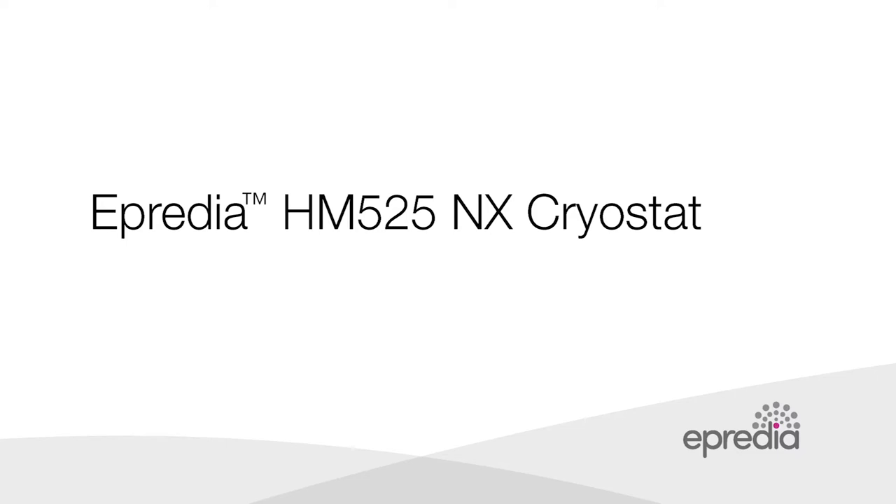The HM525NX cryostat from Epredia is a high-performing routine cryostat designed to deliver high quality results comfortably and efficiently. In this video we will demonstrate the key features and values of the HM525NX.